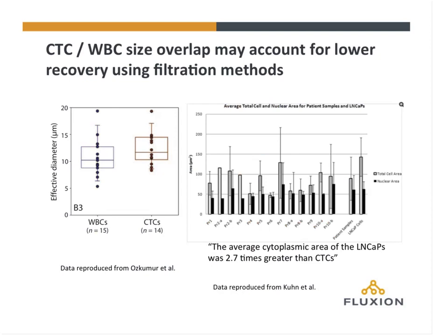And you can see that about 30 to 40% of the CTCs would fall below the threshold of most filter systems. Most of the filters have a pore size of around 8 microns, which effectively means you need a cell 10 microns or greater to really be caught by the filter and not squeeze through. But conversely, you'll see about the same percentage of blood cells falling above the size threshold, which explains why there might be considerable amounts of white blood cell contamination and clogging on these platforms.